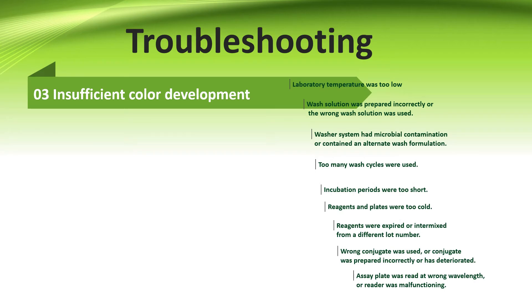When there is insufficient color development, the reason could be: laboratory temperature was too low. Second, wash solution prepared incorrectly or wrong wash solution was used. Third, the washer system had microbial contamination or contained an alternate wash solution or formulation. Fourth, too many wash cycles were used. Fifth, incubation period was too short. Sixth, reagents and plates were too cold.